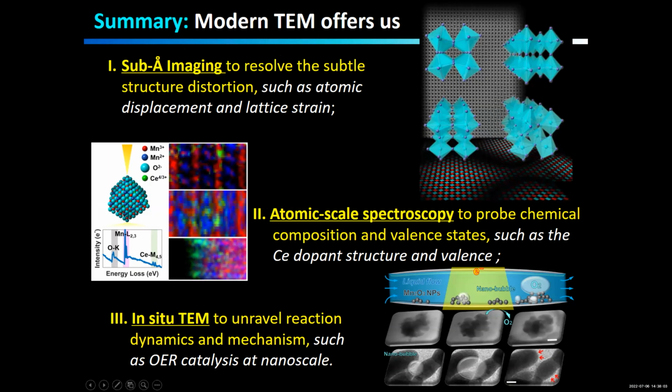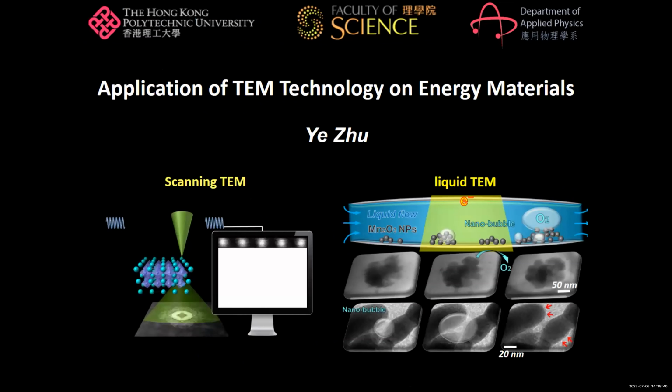Maybe I'll start with a question first. Dr. G, in the first few slides you showed us the capability of the TEM. It can actually distinguish atoms with different size or different mass. So I would like to know what sort of difference you can resolve. For example, if I look at the periodic table, the elements carbon, nitrogen, and oxygen are close to each other, right? So for elements like this, can they actually be distinguished with the current technology?